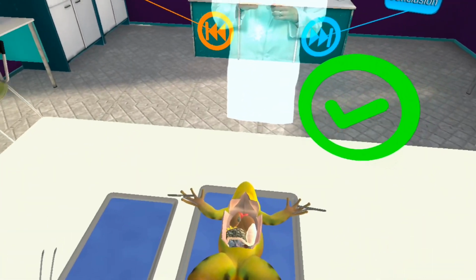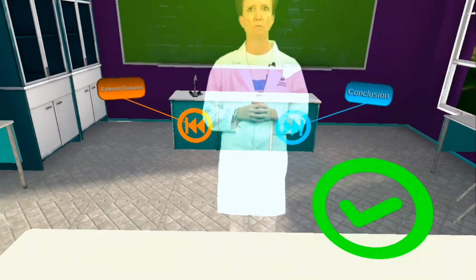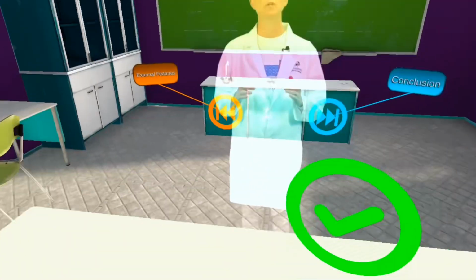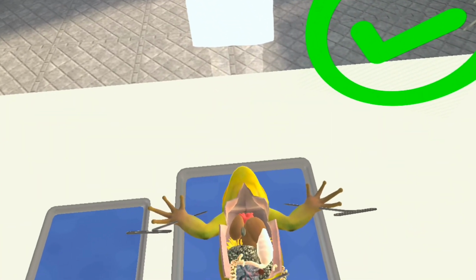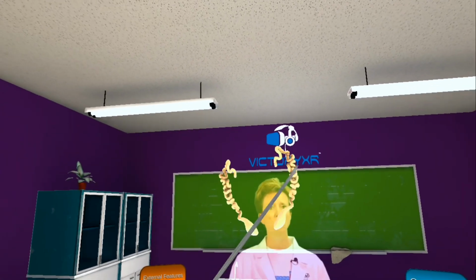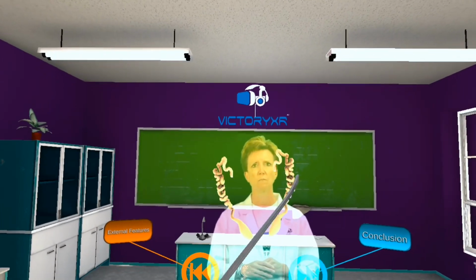Now go ahead and locate the coiled tubes of the oviducts. If the eggs in the ovaries are not fully developed, the oviducts will be small and tightly coiled. Yours will probably appear larger. The oviducts carry the eggs to the cloaca, where they look like earphones.